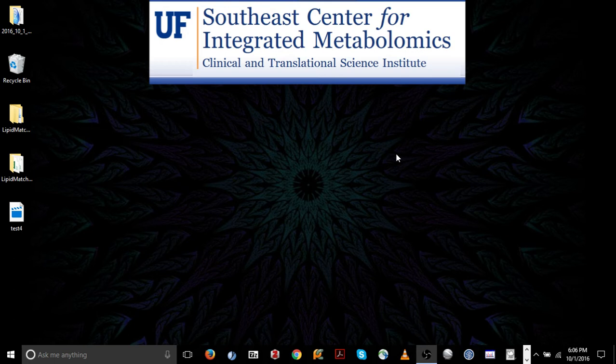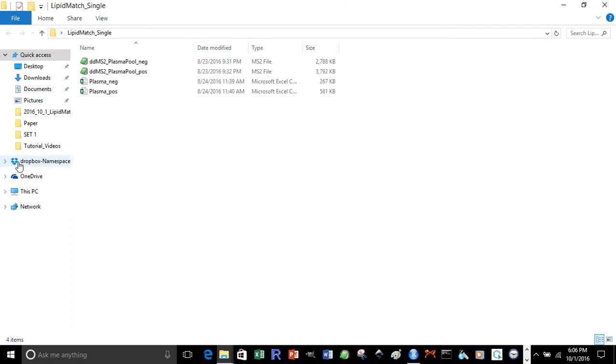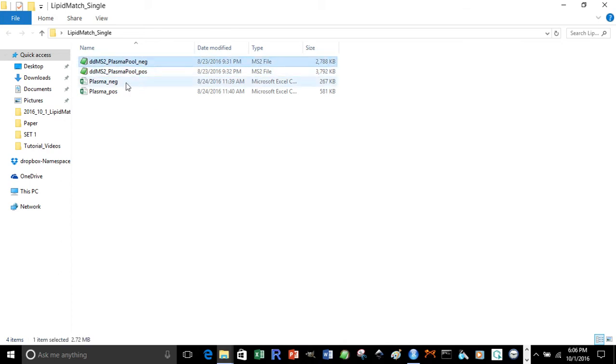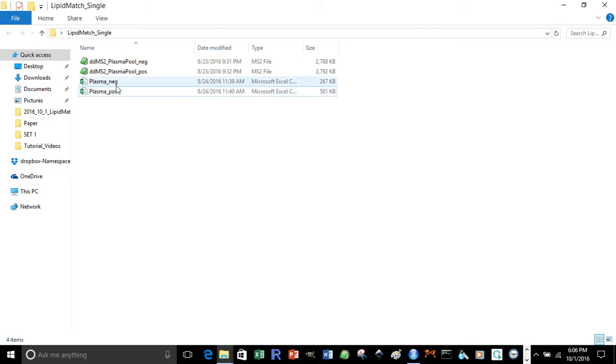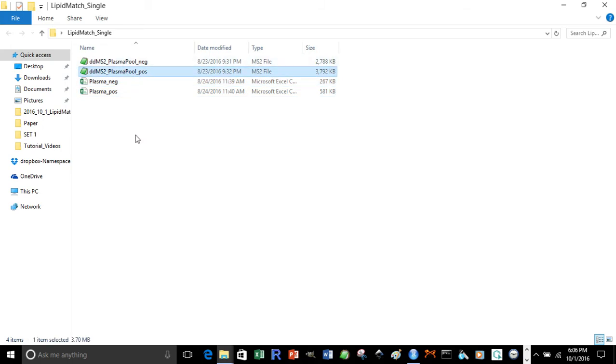The first thing you have to do is organize a folder with all your input files. Files can be organized in multiple ways. For the most simple way, generate a folder and include your data-dependent files, both positive and negative, as well as one feature table for negative polarity and one feature table for positive polarity. It's important to note that you can only have one feature table per folder for each polarity, but you can have as many data-dependent or MSMS files for positive and negative polarity as desired.